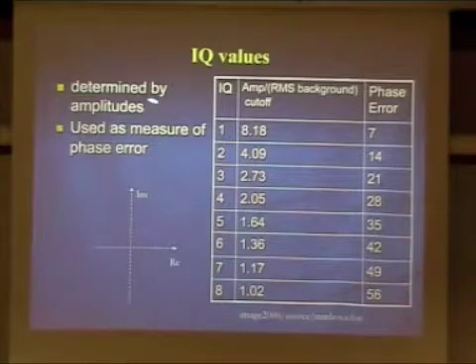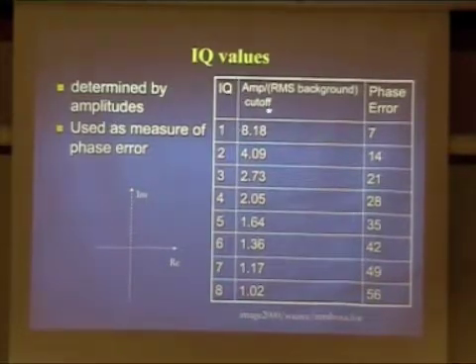Well, actually, they determine the IQ value by the amplitude ratio between the amplitude through that sync function fit and the background.